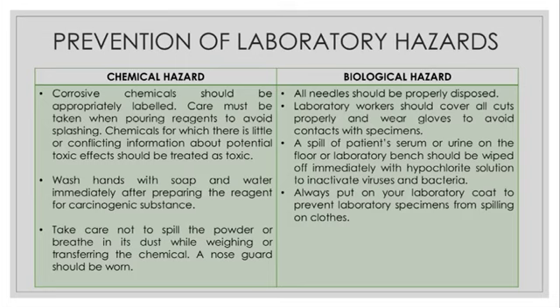Okay, for biological hazards, all needles should be properly disposed of. Laboratory workers should cover all cuts properly and wear gloves to avoid contact with specimens. A spill of patient serum or urine on the floor or laboratory bench should be wiped up immediately with hypochlorite solution to inactivate virus and bacteria. Always put on your laboratory coat to prevent laboratory specimens from spilling on clothes.